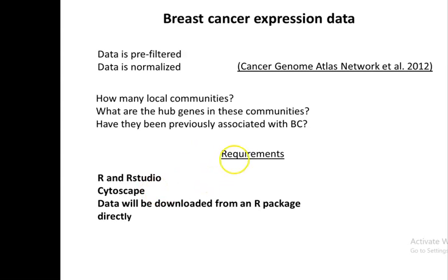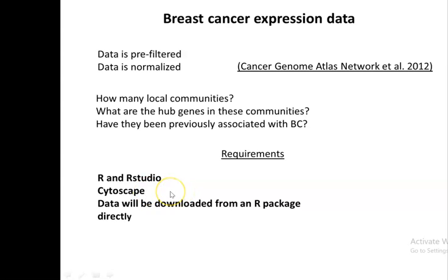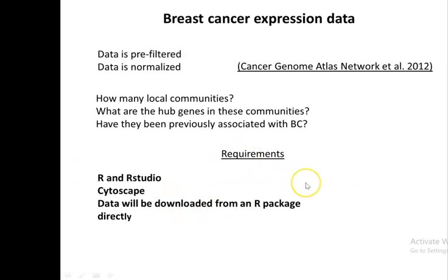As I mentioned in the intro video, you will need R and RStudio. We are going to obtain a graph file that we can then load in Cytoscape and interactively visualize it. So that's why you also need Cytoscape installed. You will not need to download the data from anywhere because it already exists as a dataset in the R package MixOmix and we are going to get it directly from there. Let's go to the R tutorial.